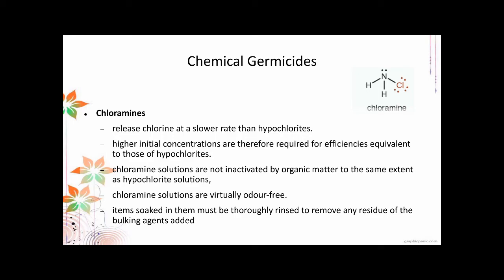But the good thing about this one is that it releases chlorine at a lower rate. It is not necessarily inactivated by organic matter to the same extent as hypochlorite solutions, and is virtually odor-free. Since it releases chlorine at a lower rate, items soaked in chloramine must be thoroughly rinsed to remove any residue and bulking agents in it.